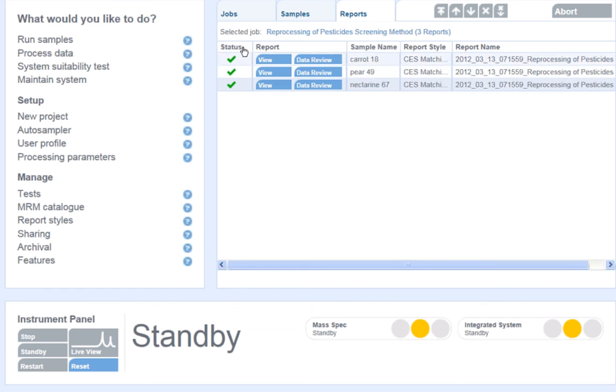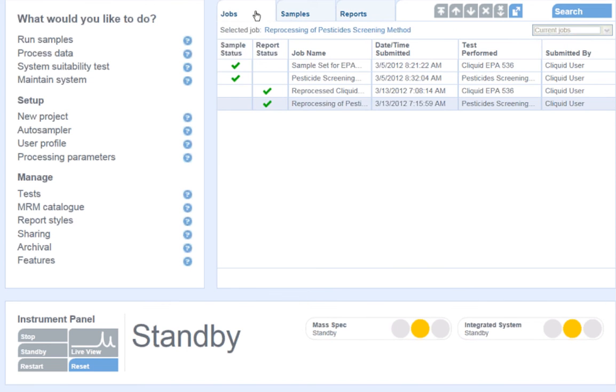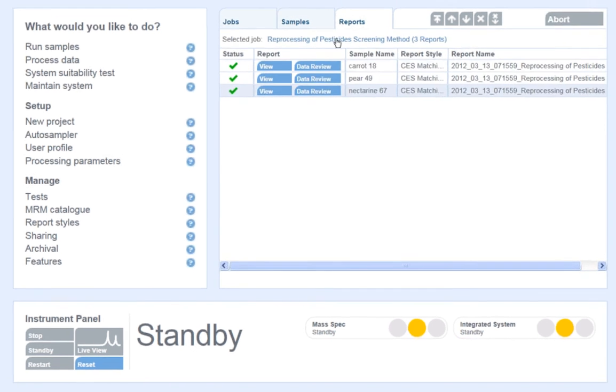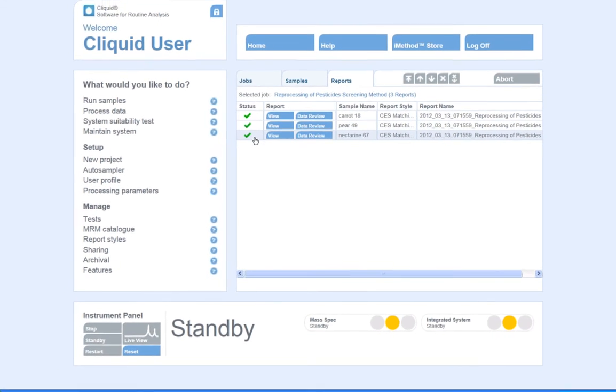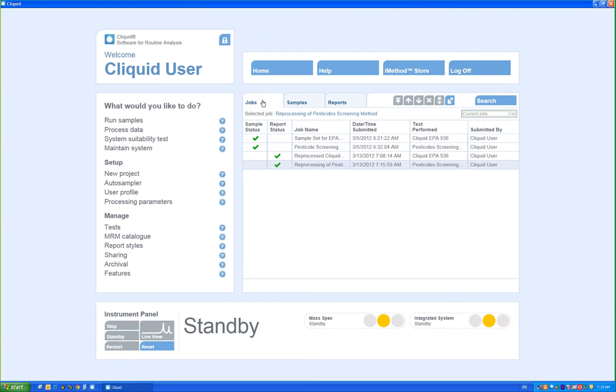At the end of all of my report generation, each of my samples has a green check mark. And if I go to the home screen, my job will also have a green check mark next to its name, indicating that all the data processing has been complete.